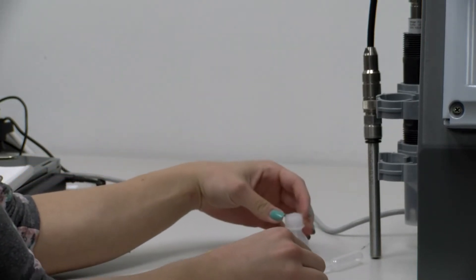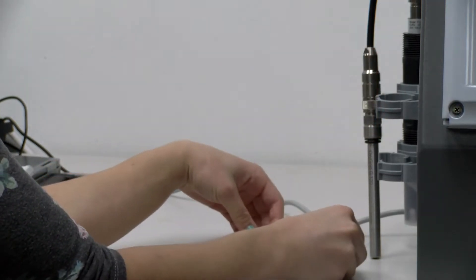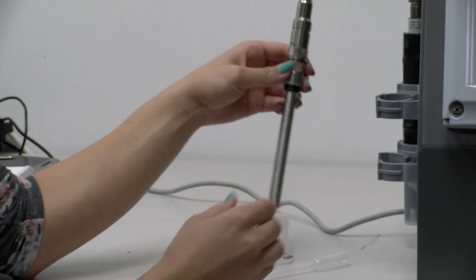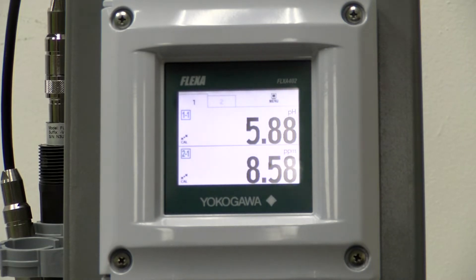The membrane cartridge needs to be filled using a pipette with 1.5 milliliters of the electrolyte. Then the cap needs to be screwed back on carefully and tightly. After plugging in the Flexa unit, you need to go through the initial setup and configuration of the sensor.